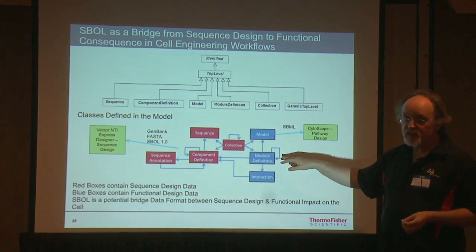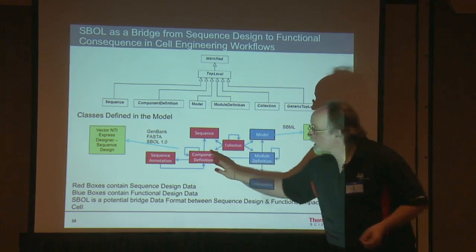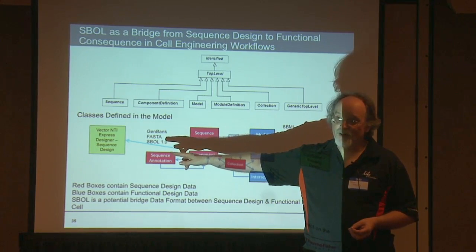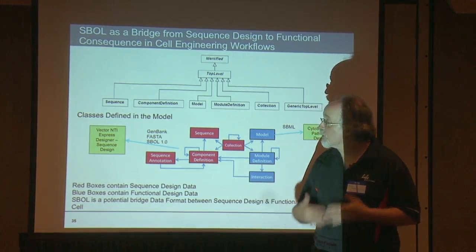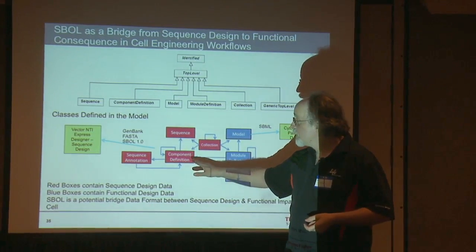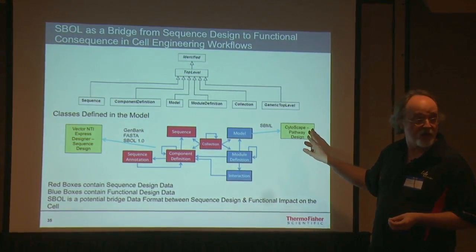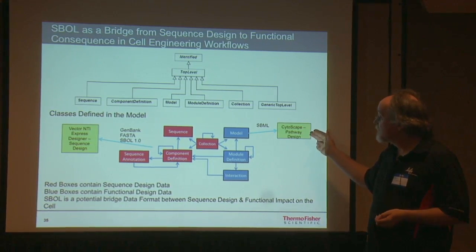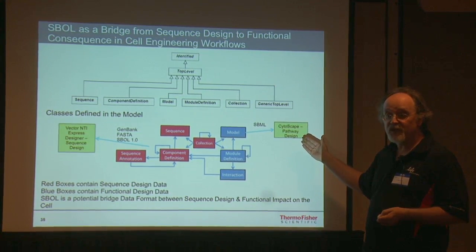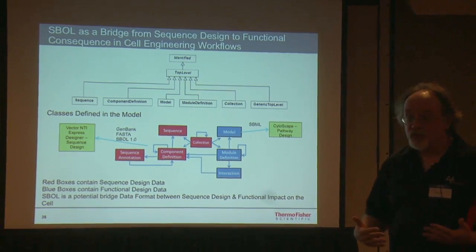But SBOL also contains information about what it's going to do once you actually get it into the cell. So we have a very nice synergy where we have sequence information, and this basically overlaps the traditional molecular biology crowd. Okay, and again, I have a software, Vector NTI Express Designer, which is a synthetic biology software. But nonetheless, we have the ability to bridge not just the traditional molecular biology, but also potentially taking this information about our guide RNA and its on-target and potentially off-targets and pushing this information into software like, say, Cytoscape, which are designed for pathway analysis or pathway design. Okay, so it's a potential bridge format.